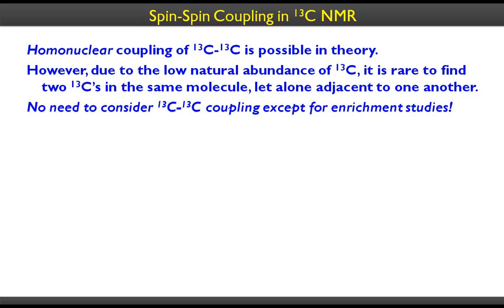How about spins? We learned the types of peaks, shapes of the peaks. We learned that integration doesn't have any sense in carbon NMR because of the discrepancies in the relaxation times. We also learned about the chemical shifts. Now to move to the last parameter that we learned, that is spin-spin splitting. Is there spin-spin splitting in carbon NMR?